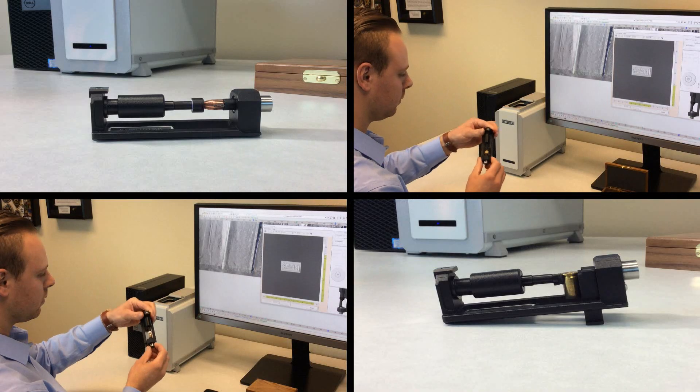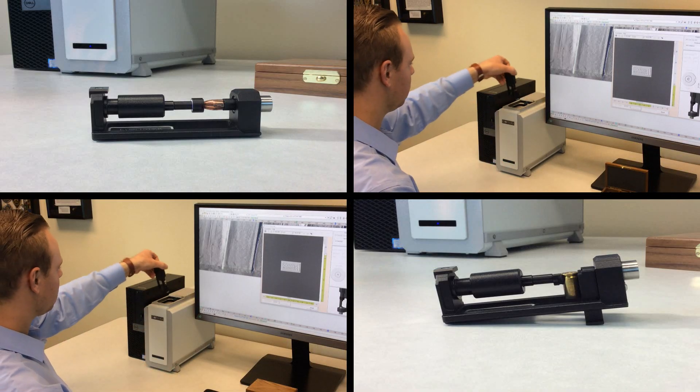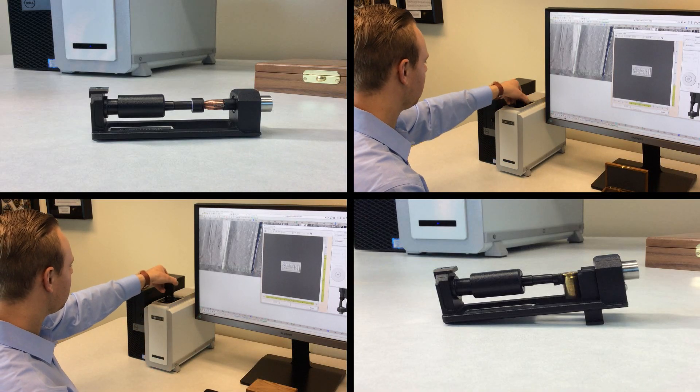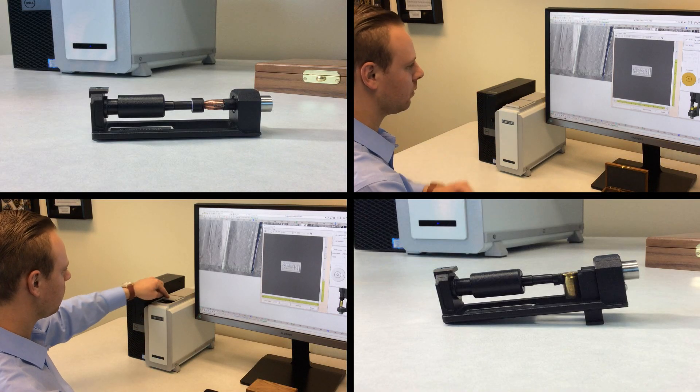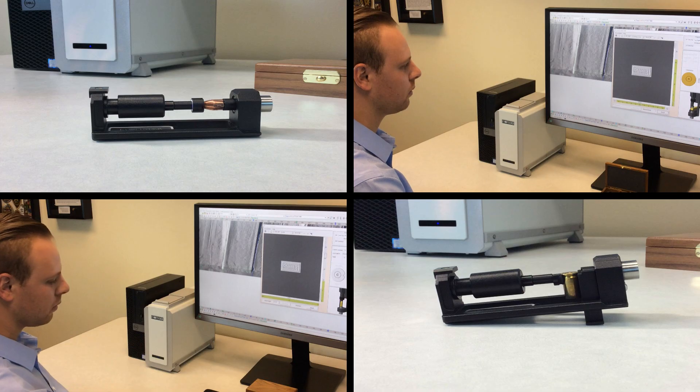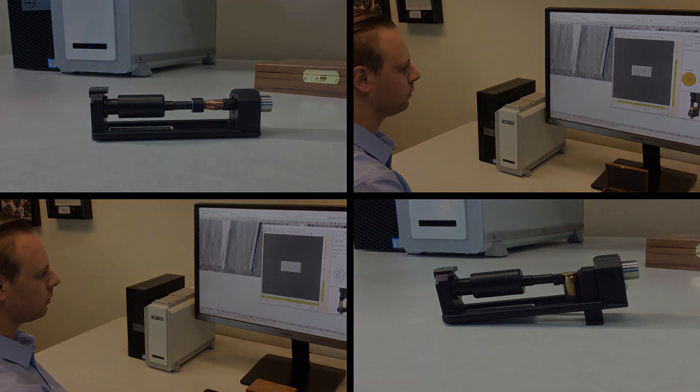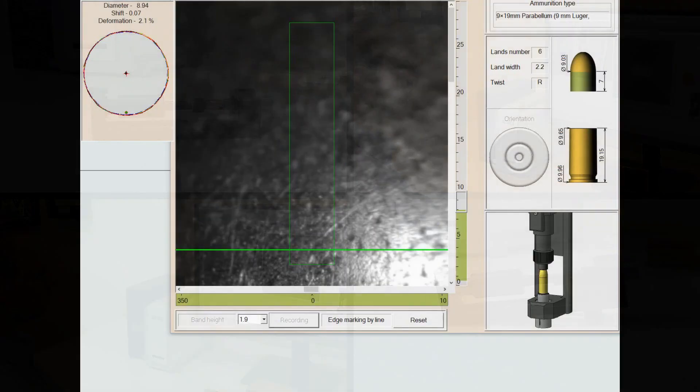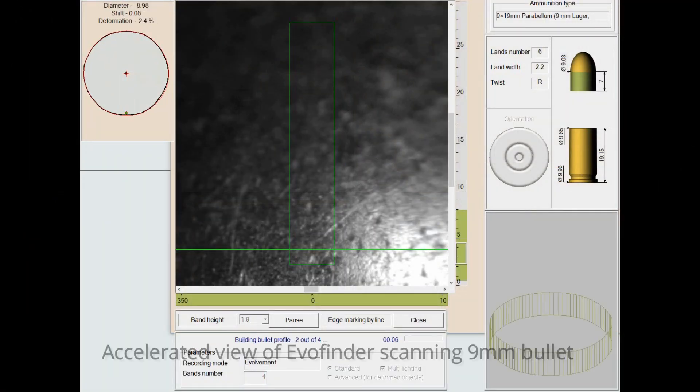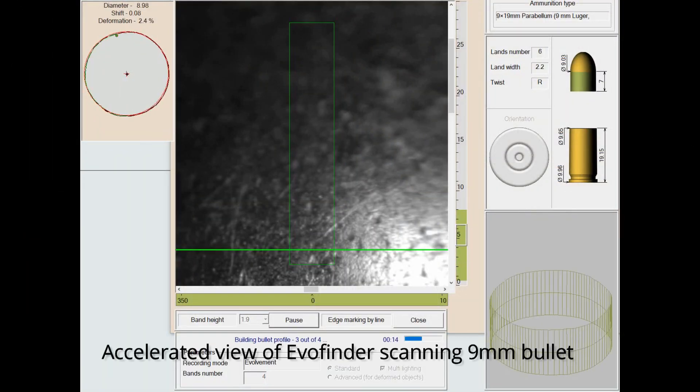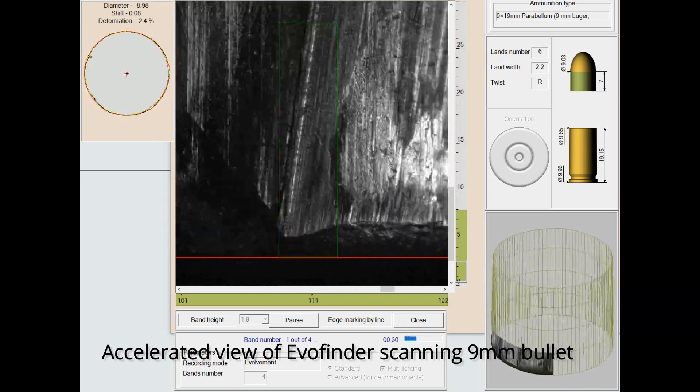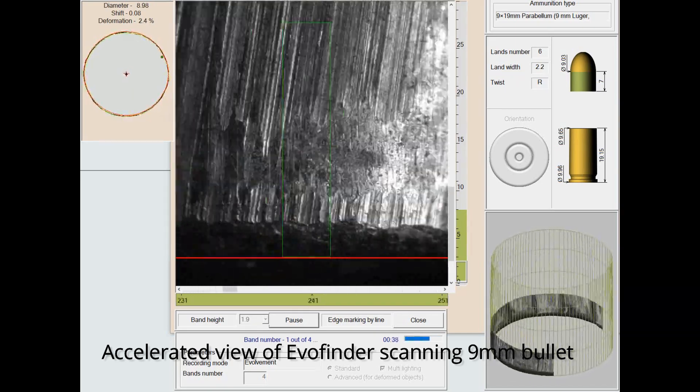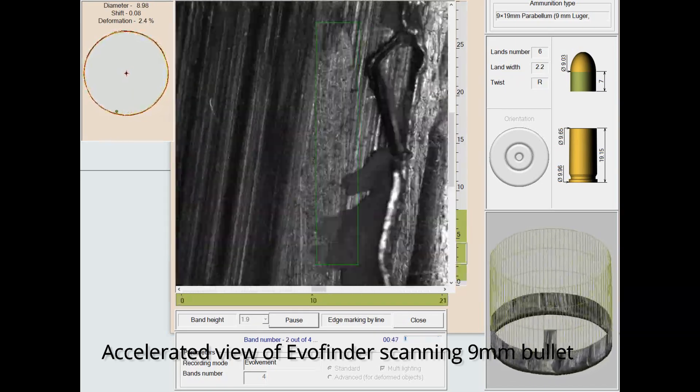This uniquely versatile system provides the ability to image bullets, bullet fragments, and cartridge cases utilizing multiple sophisticated imaging techniques to generate 3D images without the need for rigorous sample repositioning or consumables.